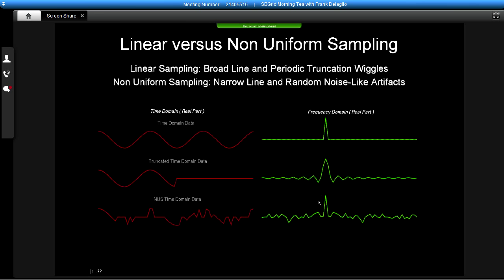And the bigger the signal is, the bigger these artifacts will be. And the shape of these artifacts will be the same for every signal. But big signals will have big ones, and small signals will have small ones. All of these are sampling schedules, and they all have different corresponding response functions.